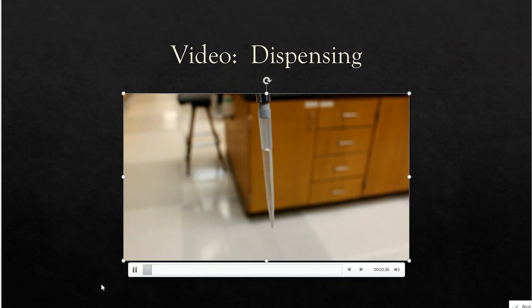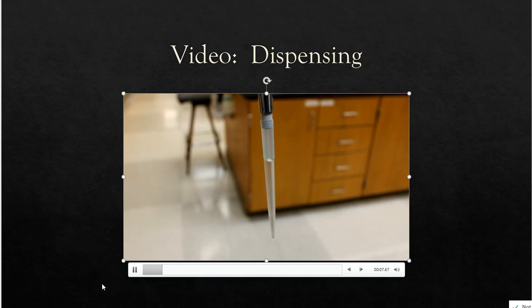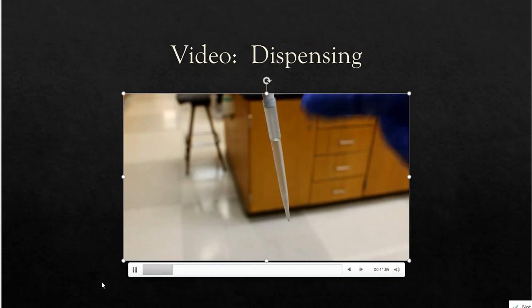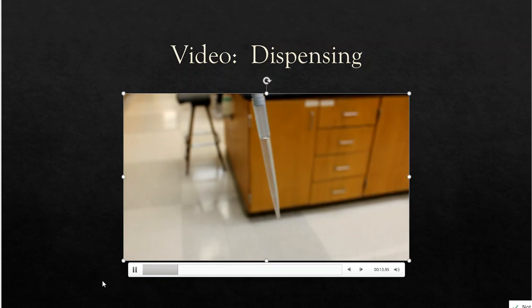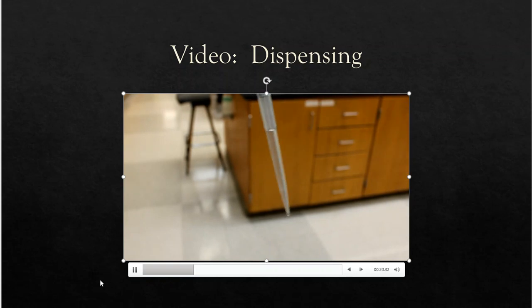Guys, what you're seeing right here is the micropipette tip, and it's filled with liquid. It's really nothing more than water, just for demonstration purposes. But you can see the liquid level that's right up here at the top. So this is 1,000 microliters, and that line is a very good sign that it did suck up the proper way. It gives me a very good judgment call on whether or not I used the micropipetter tip properly.